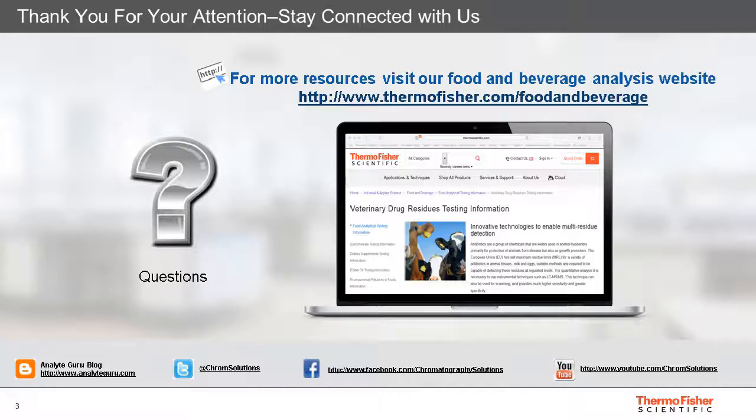But having said that, if you use the reverse phase cartridge which we described in the experiment, that provides protection against that possibility. So those are just a few things which we can do. We can also clean the column as well if necessary, and it's a really simple maintenance. Ongoing regular maintenance will give you very good performance over an extended period of time.